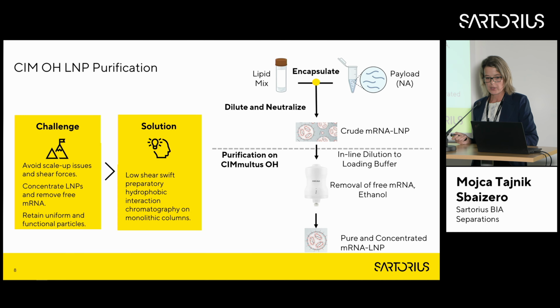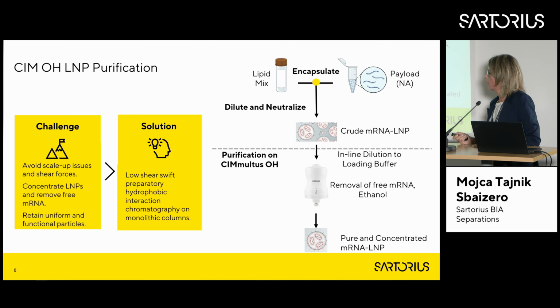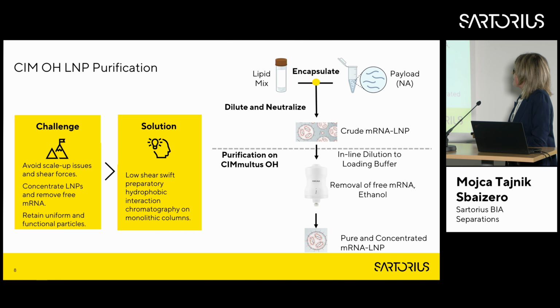So I already mentioned the shear stress is our main goal to lower during this purification, because it's the most important. We get at the end the active particles so that the mRNA inside will be able to express in the cells.